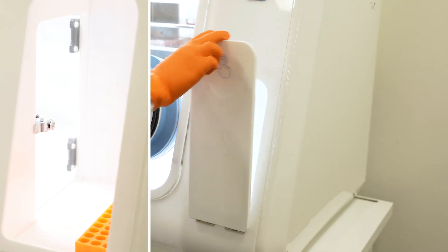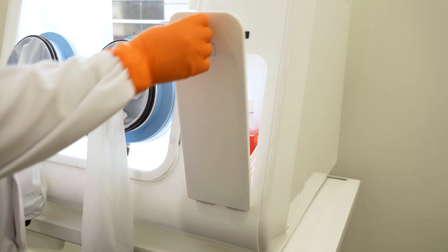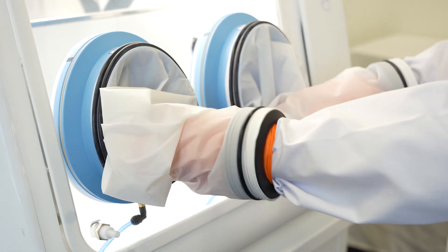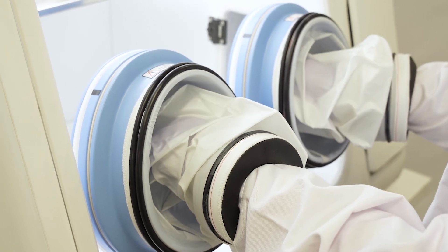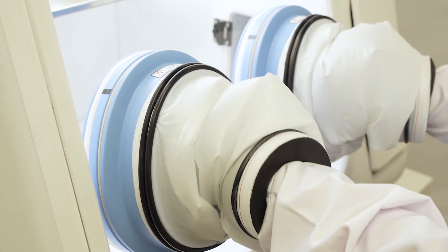The spacious interlock provides a quick purge of atmospheric conditions in as little as 20 seconds. Combined with an acrylic airtight chamber and our gloveless cuffed easy-sleeve system with a nitrogen purge, the i300 provides quick access to the chamber while maintaining stable environmental conditions.